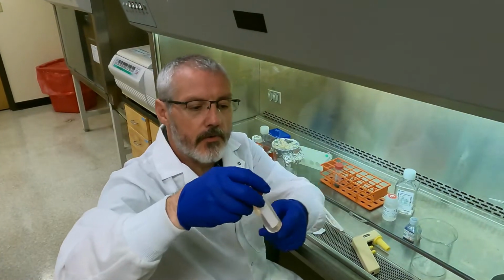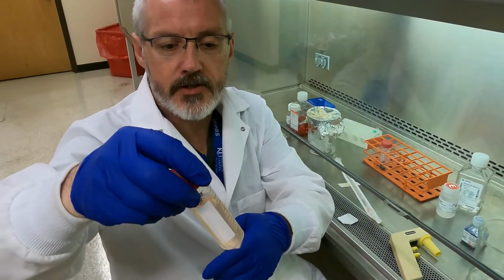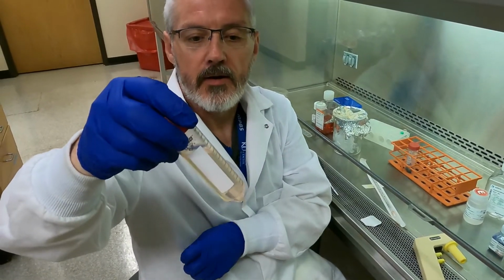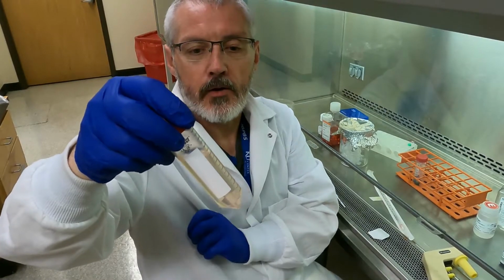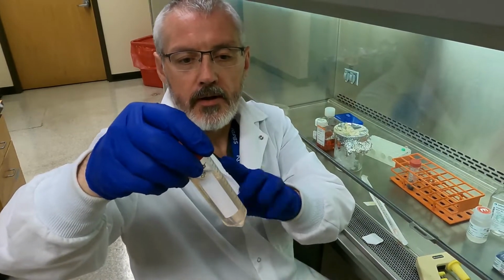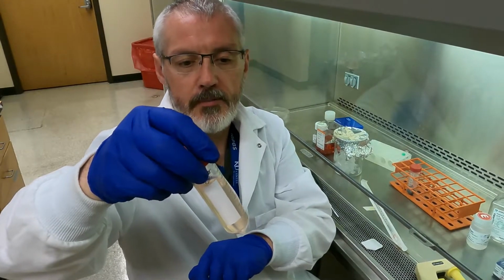What we've done is we've trypsinized the adherent RCTE cells off the plastic and recovered them. They've got a nice pellet there. There's about 7 to 10 million cells there. So we need to quantify them. So the first thing we're going to do is just tip off the supernatant and take this up in 10 mils of PBS.